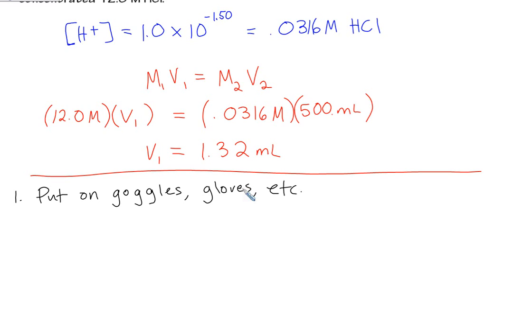Number 2. Again, look at the equipment that they have listed. We'll probably have some kind of a graduated cylinder. Use a graduated cylinder.